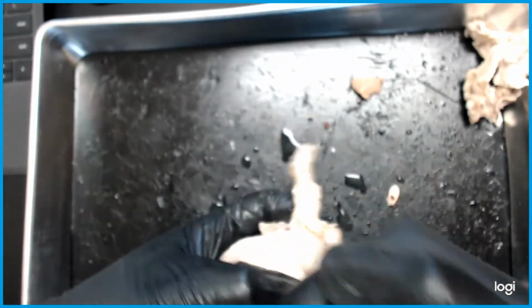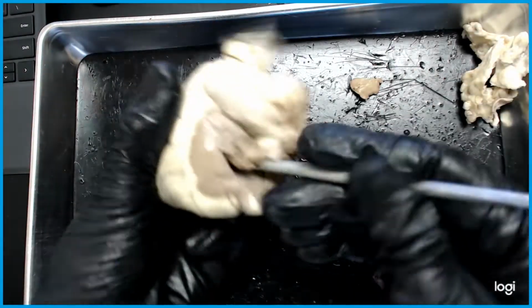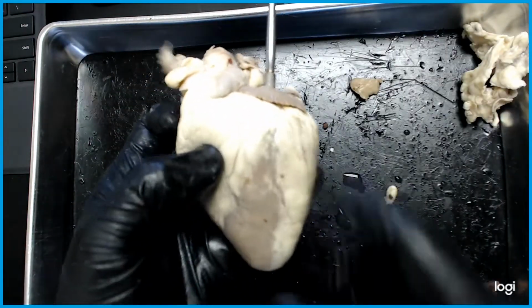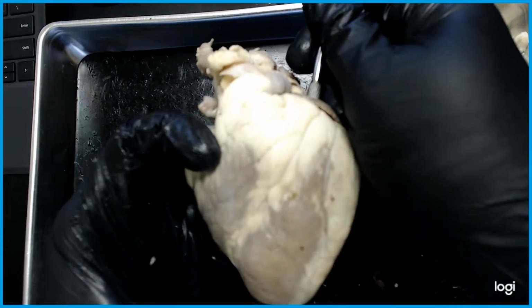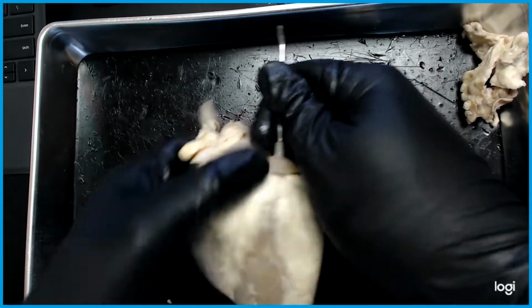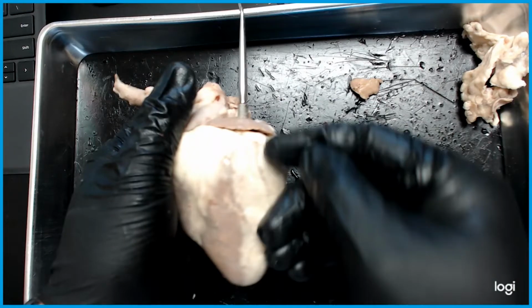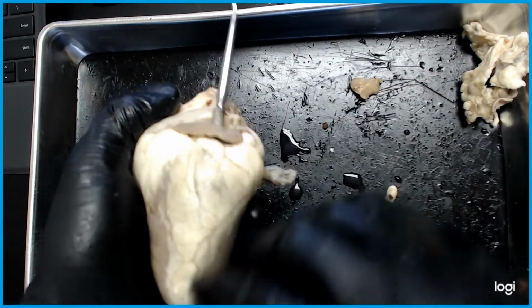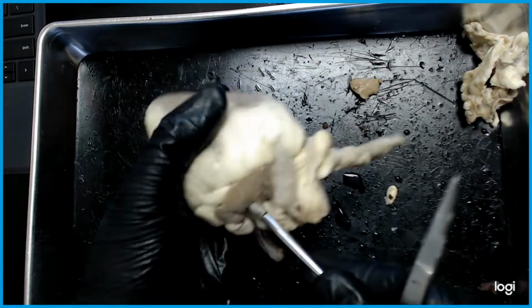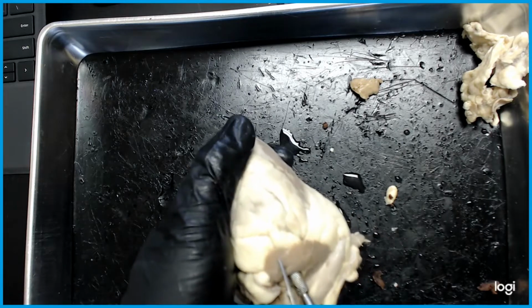So what we do, same thing we did on this side, we want to go and find the apex, the lowest portion through the ventricle. So we're in, and let's go ahead and find it. Now I know that my probe is in there, and we'll reach the apex portion. I can actually touch it here, and that is where I want to do the cut. I don't want to cut right where the septum is because I want to see the effect of it. So I want to follow this portion of the coronary artery where you have the fat. Let's go ahead and cut that open. So once again, use the probe as a guide, and I can follow it through.